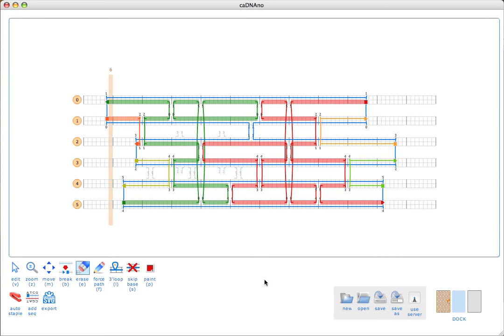The first thing you'll notice about these staples is that some of them are drawn thicker than the standard lines. The thick staples are highlighted because they're either circular paths or they're outside the recommended size range for the length of a staple, which is between 17 and 50 bases, non-inclusive.